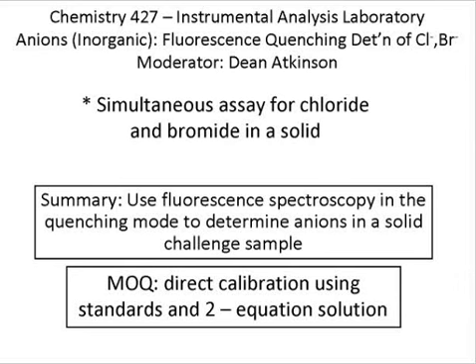You'll work your way back to the assay for the solid, the ions in the solid, which makes kind of a nice tie-up to the end: how well can you determine the solution phase concentrations, and how well can you work your way backwards to a solid phase concentration or a solid phase composition.